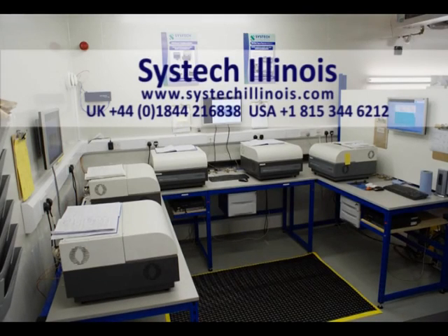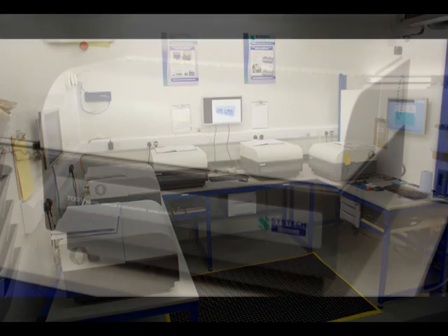Introducing the Systech Illinois 7001 Water Vapour Permeation Analyzer. This is used for testing the amount of water vapour that will permeate through your packaging barrier films, PET bottles and packages of almost any type.